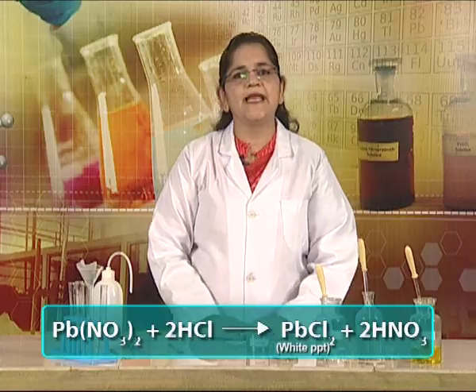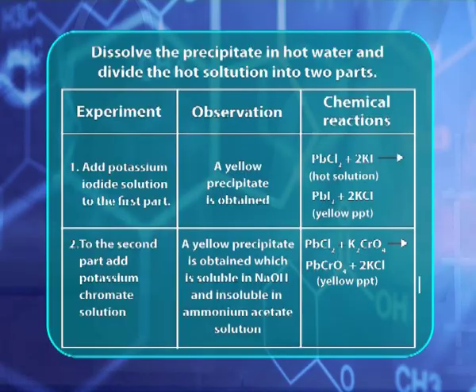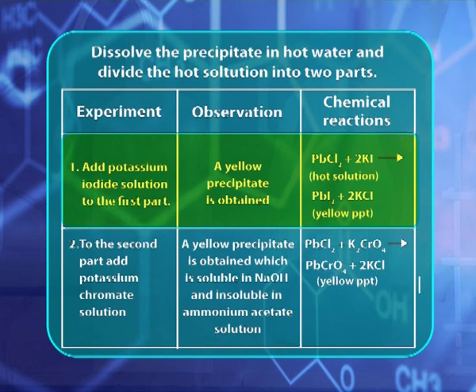Confirmatory tests for lead ion are made by taking the hot solution of lead chloride in two parts. In one part, we add KI solution — the formation of a yellow precipitate shows the presence of lead ion. In the second part, when we add potassium chromate solution, the formation of a yellow precipitate confirms the presence of lead ion.